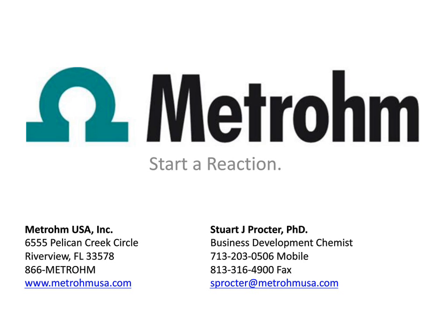Yeah, and this is Joni, and I agree with both Stuart and Jen. And then there's also another aspect: sample prep has been considered a bottleneck, but you also have to realize the reams and reams of data that these high powered triple quads and ion traps and TOFs are producing, and that has to go through.